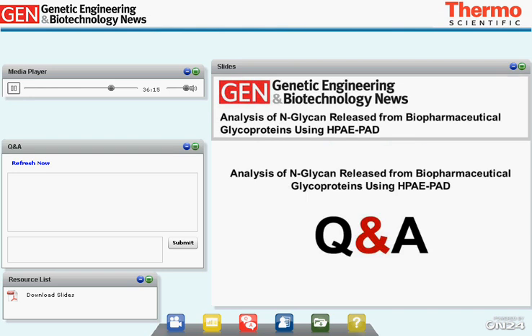Okay, so let's take our first question from the audience, and it's for Peter Jandik. Can I use HILIC columns with pulsed amperometric detection? Thank you, John. HILIC columns are typically used with mildly acidic eluents, also containing a relatively high concentration of organic solvents. Those two conditions are unfortunately not suitable for pulsed amperometric detection.